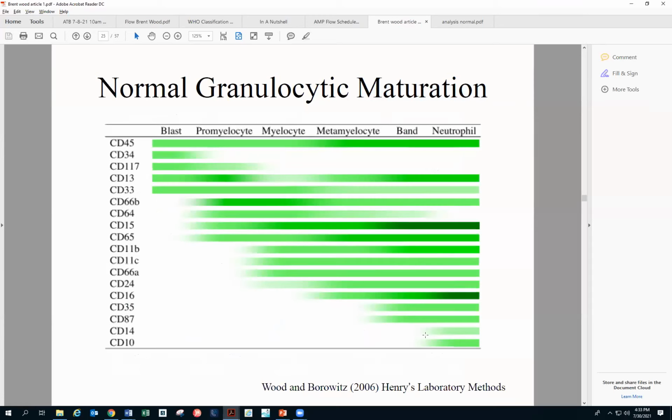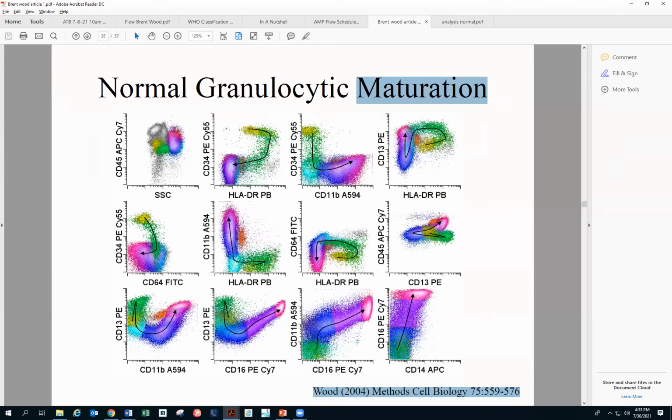So again, as I was saying, it is absent in here, but it is kind of appearing in the neutrophil stage, and that too dim. If you see, the normal monocytes will be brighter for 14 than the normal neutrophils. So it goes there. However, it is still very dim compared to the normal monocytes. Did I confuse you even more than you were before?